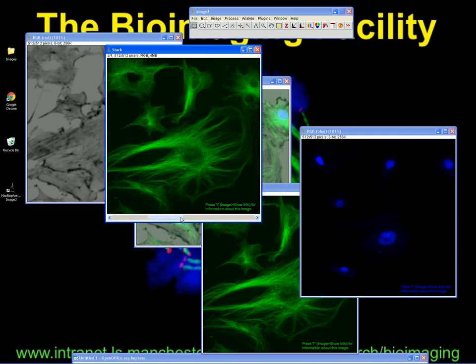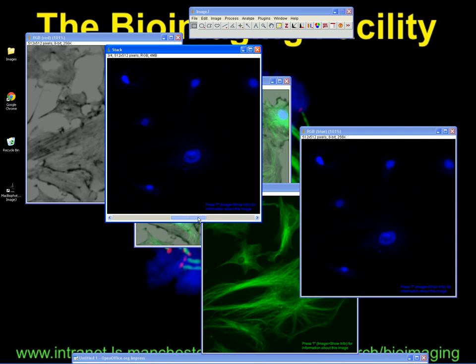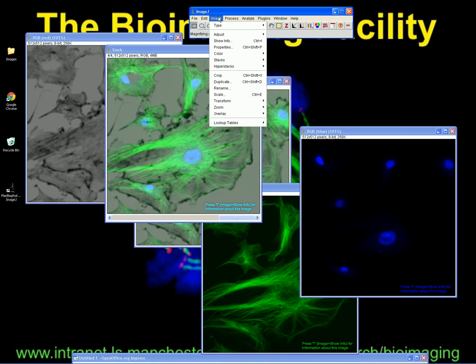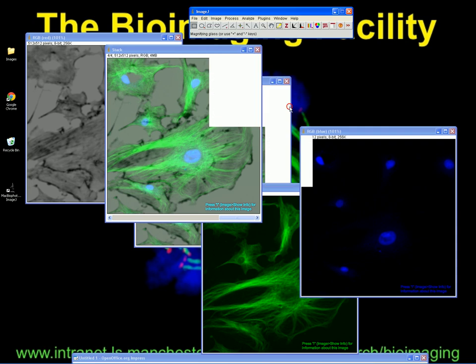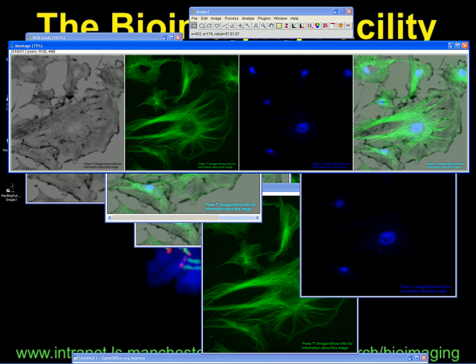These might be in the wrong order. So if we were just going to make a montage of this, it would go grayscale, green, blue, merge. Under Image, Stacks, Make Montage — you've just got to decide how you want it to look, similarly to the RGB montage plugin. We want four images across, one down, scaling factor of one, use all four images, and a border width if desired. That produces your grayscale, fluorescence, and merged image.